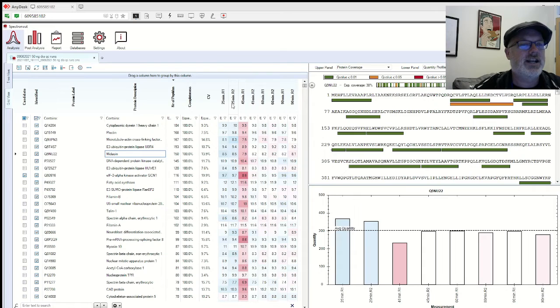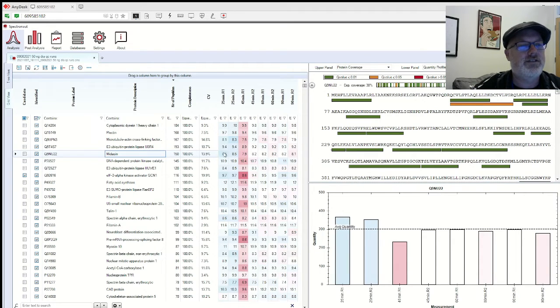But remember, with your data, we use the same gradient throughout. With this experiment, we're doing different gradients, which we would never do with your data. But it's an interesting analytical exercise to try to guess why this protein seems to be more expressed with a shorter gradient than with a longer one. If you have any thoughts on this, I have some theories. Just let me know.